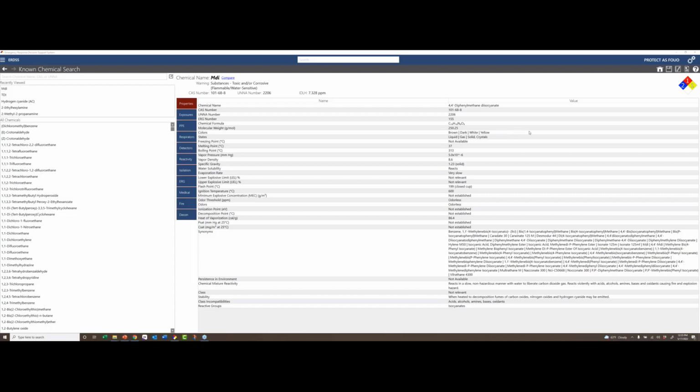Okay, so some of us do carry, especially those of us that did, I don't know if anybody else is near and dear to my heart, but I'm old. The hazmat kits using the old wet chemistry where we always carried that material and small amounts of hydrochloric in solution that we could use a couple droppers full, wet things up and go with it that way. That was fantastic. A lot of teams just don't do that anymore.